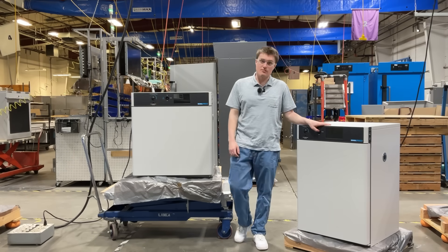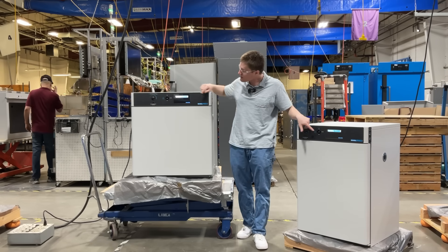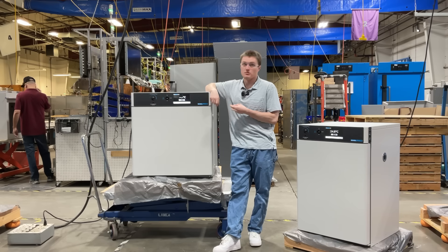After connecting the unit to power, it is ready to be turned on using the main power switch located here. After a moment, the new 7-inch digital touchscreen becomes available.